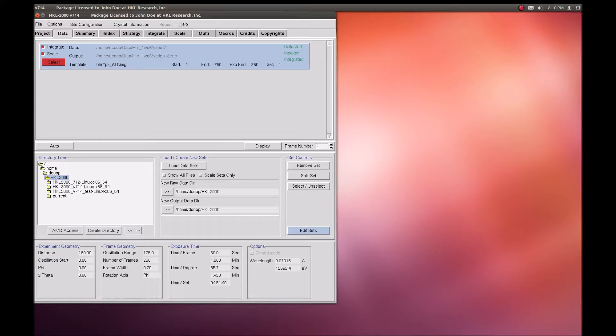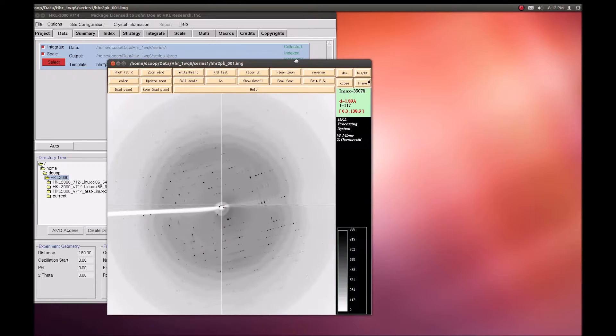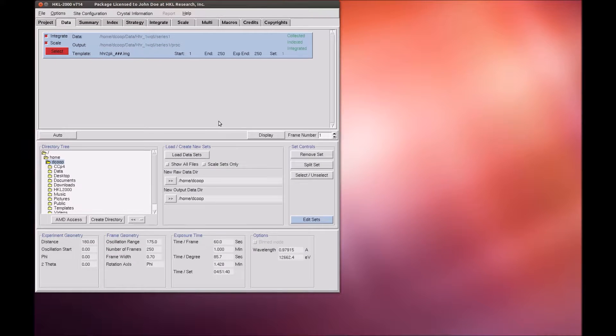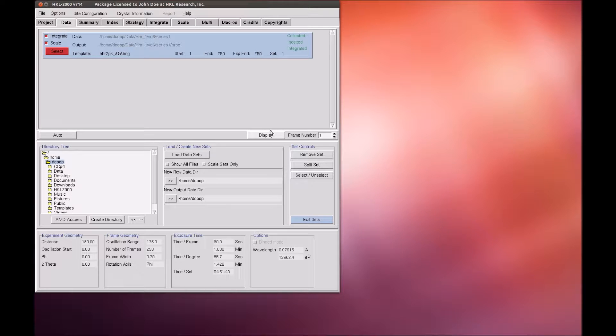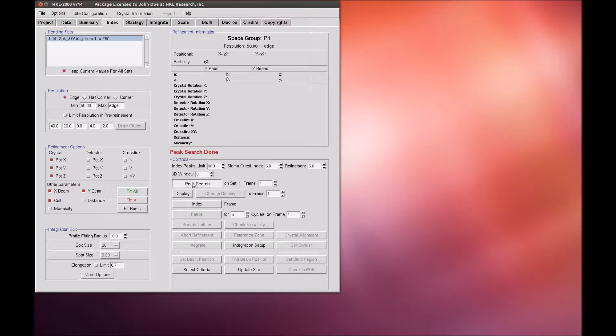Many of the new features will be intuitive for those familiar with the old version of XDISP. As before, you can launch the new version of XDISP using either the Display button in the Data tab or the Display or Peak Search button in the Index tab.